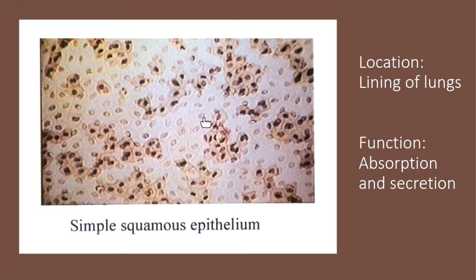And so that piece of paper, we can see straight through it. We can see right here there's only one nucleus, there's none behind it. And so that implies that this is a very thin layer. It's only one cell layer thick, and there's its nucleus. Okay, so that's how we can kind of infer it's simple squamous.